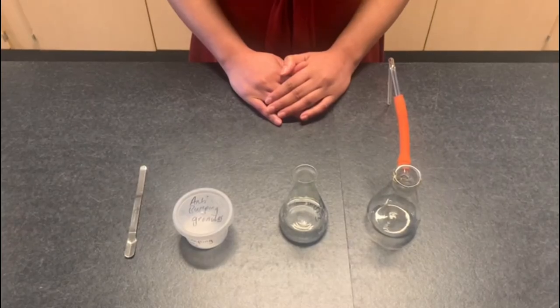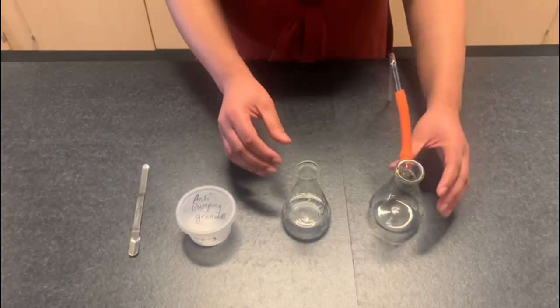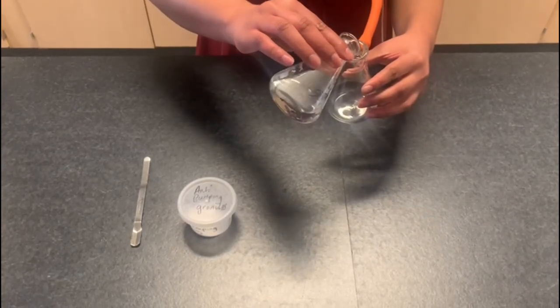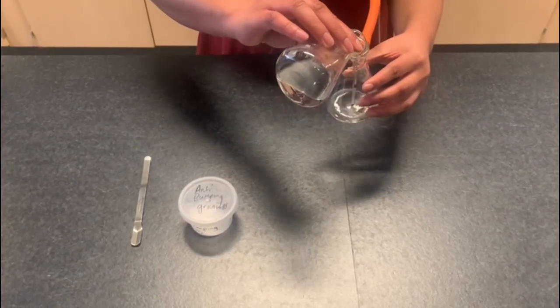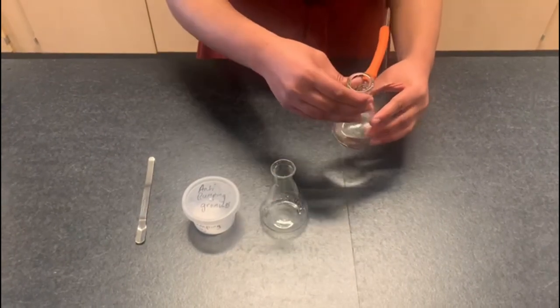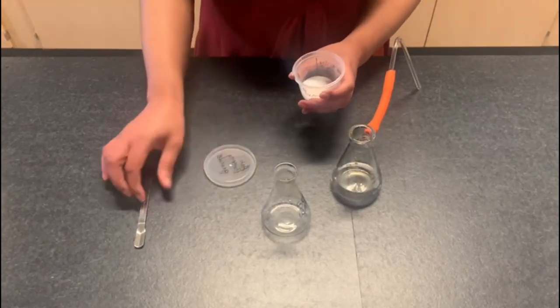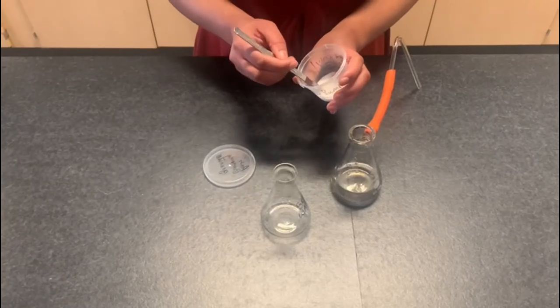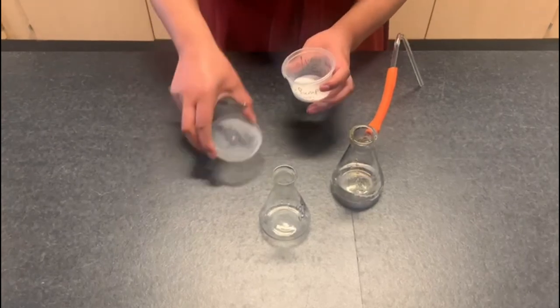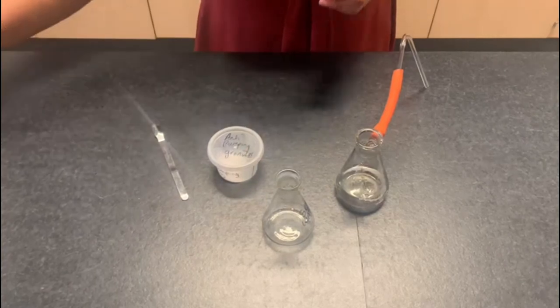I will now talk you through activity three which is the desalination of seawater. Firstly what we need to do is pour the rest of the seawater sample into the conical flask. I will then add some anti-bumping granules into the solution and we do this to stop the seawater from spitting.